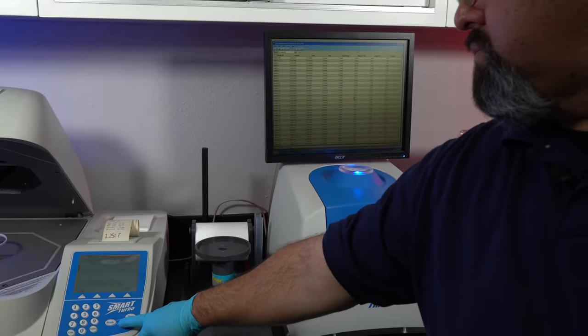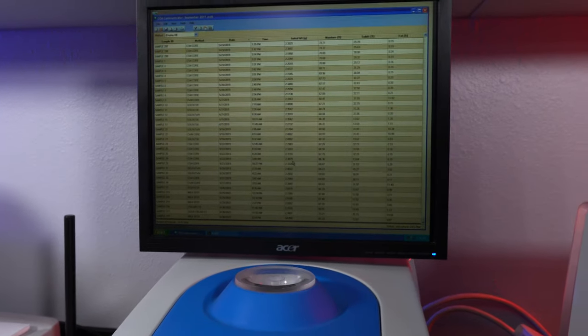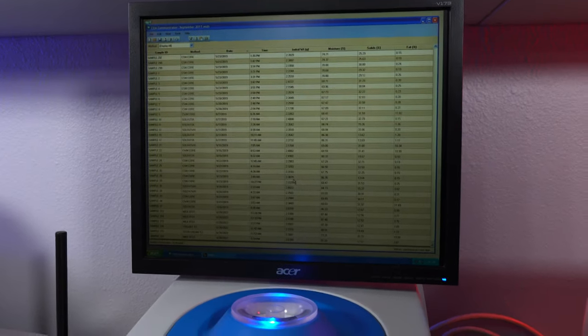Now take the tube and place it into the SmartTrack fat analysis station. Go back to the SmartTurbo and hit start to begin the fat analysis. This process will only take a few seconds. The test is now complete and you can continue with more samples.